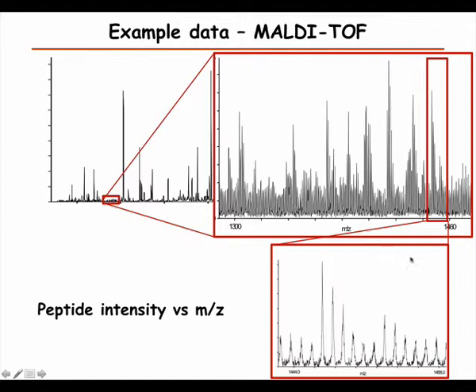We can distinguish the peptides, but again here we see that we have a very serious case of chemical noise because these peaks are smaller. And we see that the electronic or statistical noise is much smaller in this case.